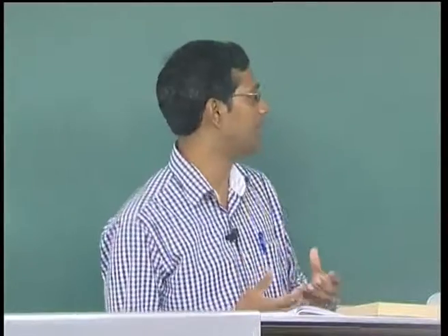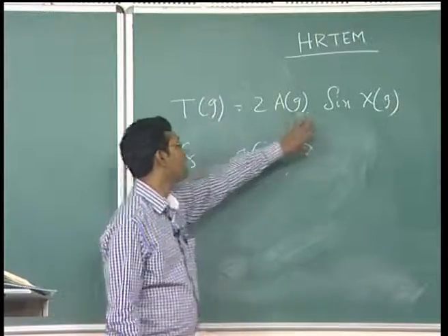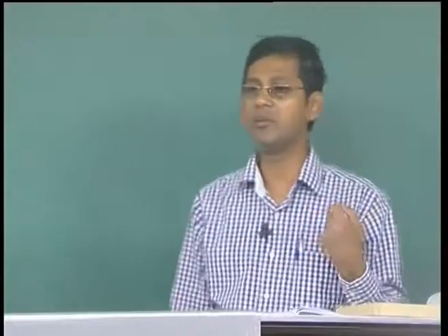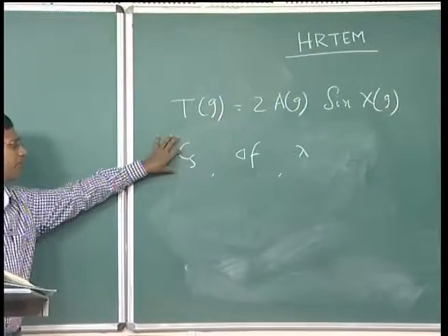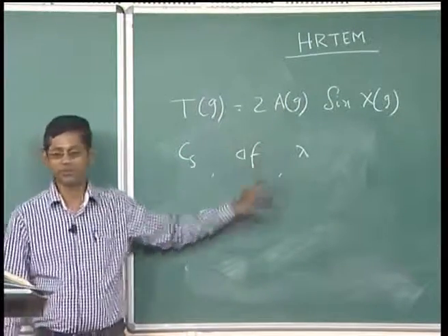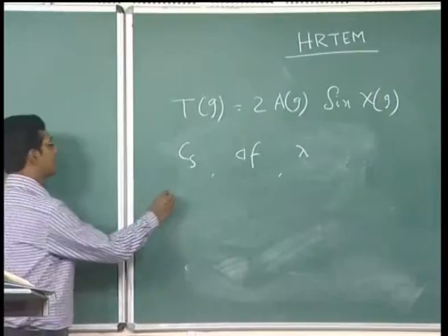So, if we consider a point at the specimen, what does it mean? The effect of this on psi z means that a point in the image plane will be focused as a disk because of the effect of spherical aberration and the defocus of the objective.